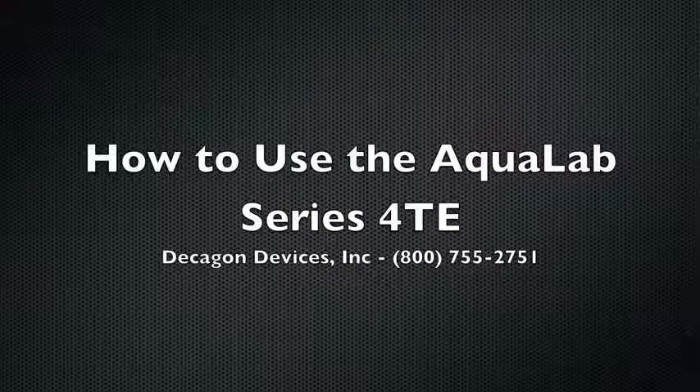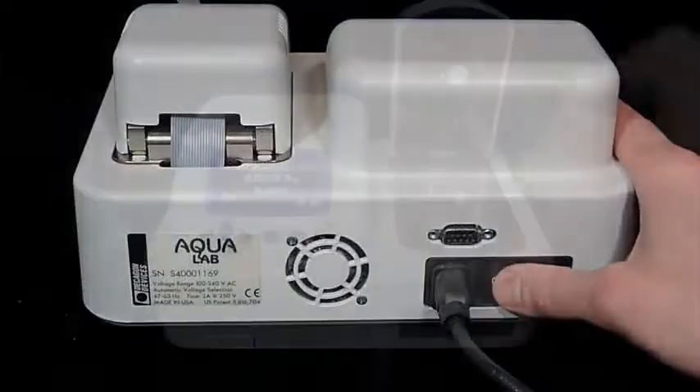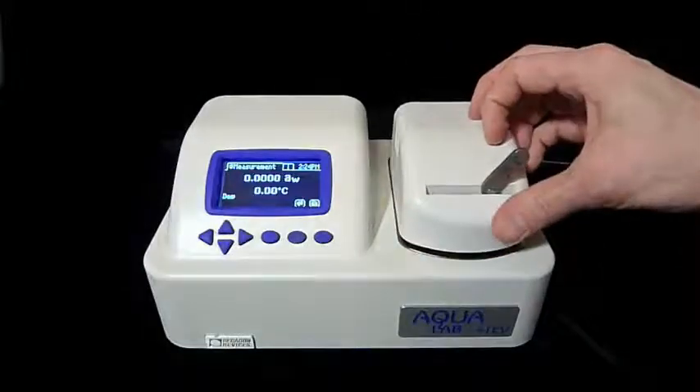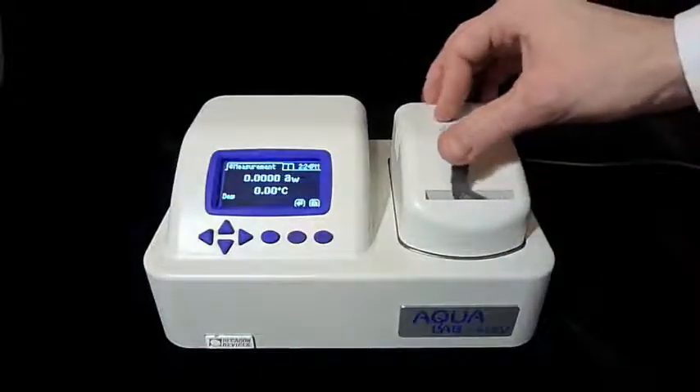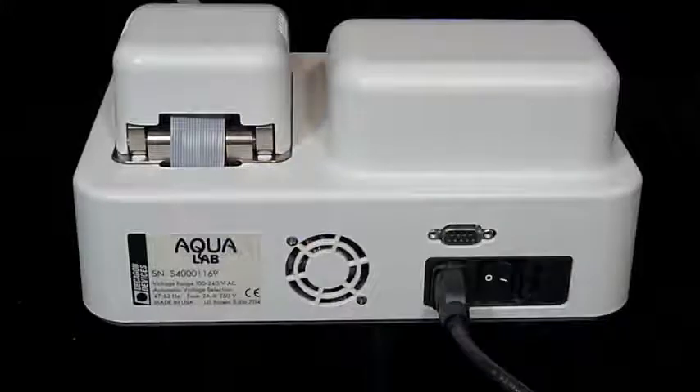The new Aqualab Series 4 TE measures water activity in 5 minutes or less, and that's about how long it'll take me to show you how to use it. This instrument is almost foolproof: turn it on, put in a sample, close and lock the chamber, wait a few minutes, and get a water activity reading accurate to plus or minus 0.003 water activity units. This video will show you how to make sure every one of your water activity measurements is fast, accurate, and clean.